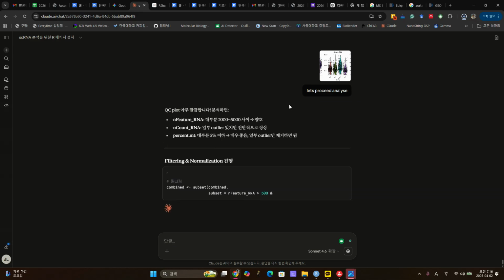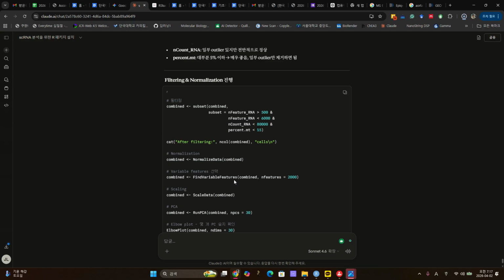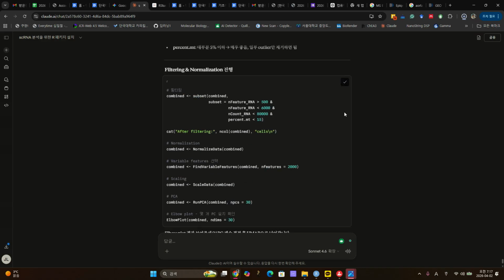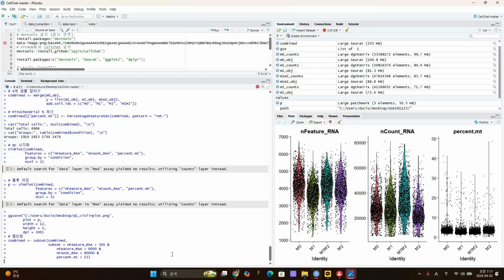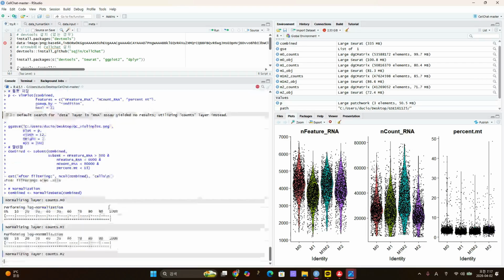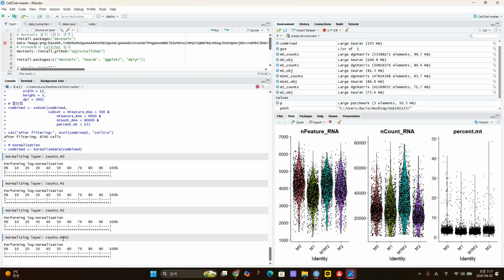They describe the meaning of this one, and then generally good. So they are doing some filtering of outliers, filtering and normalization. So these are their features. If you want to change something, you can change it, you ask. But I just follow this. They're filtering, just the outliers at the bottom and top, they remove them. So they are normalizing this layer, M0, M1, M2, M1 plus M2.